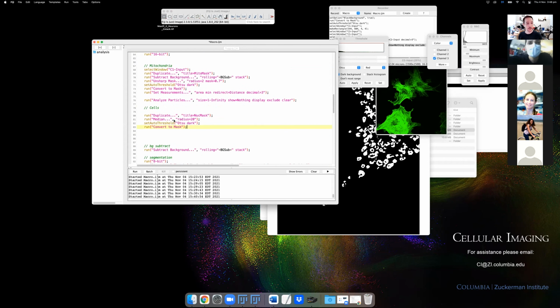Previously, a lot of getting things to work was figuring out the right combination of filters and processing to really be reliable across a whole lot of data sets, not just the one data set that we're looking at. Often you can get something to work really well for one thing, but as soon as you start working on 10 images, everything falls apart. Finding the right recipe is one of the important aspects of that. And that's kind of really gone out the window, I think, more recently with machine learning and deep learning, where we can get something very robust by training a network. That's what we're going to look at next week. So this is still useful. It's still very important to know, but don't get too caught up on how well the results are looking for this, because we can get a lot better using additional tools.